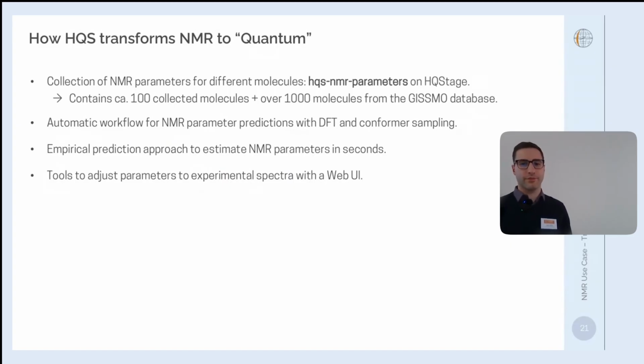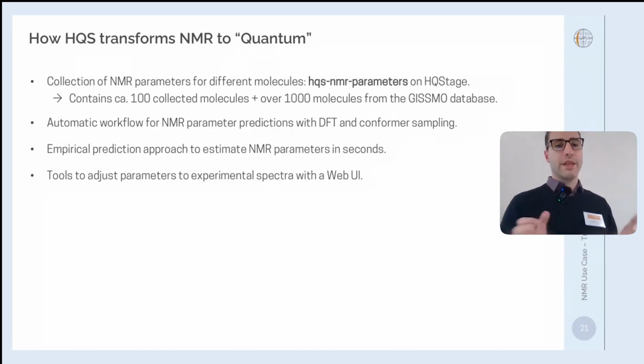Of course, with the database, the caveat applies that sometimes the procedure may converge to a wrong assignment. This is actually something that I found quite by coincidence when I was getting the data for the isoprene molecule, the one I was showing you on the slides with the spin Hamiltonian. In fact, it converged to the right numbers, but it assigned them to the wrong nuclei. So anyway, there are 1,000 experimentally determined parameters. There are about 100 molecules, which we have curated very carefully. You can use all of them.